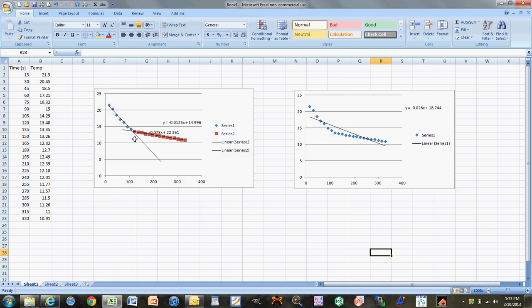You need to add the trend line for each individual series. That's why it was important to eyeball where the solution began to frost — that tells you where to end the first line and begin the second. Set the two equations equal to each other, solve for x, then plug x back in to solve for y. You should get the freezing point of that solution. Do this for all six graphs in this lab, and show your work as well. When you print it off, show below the graph how you solved for x and how you solved for y.